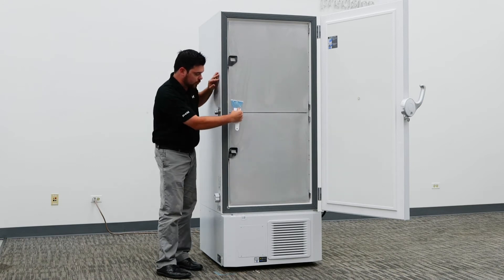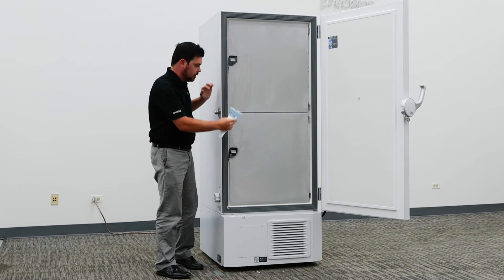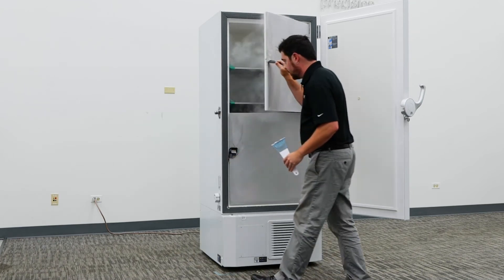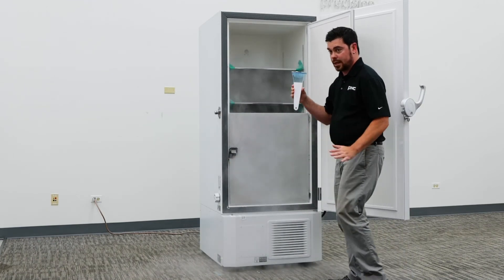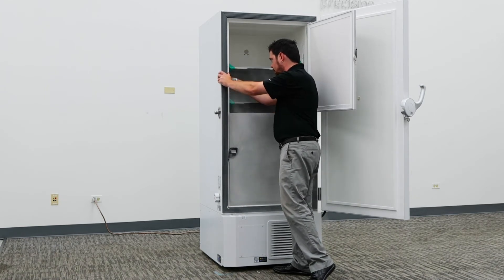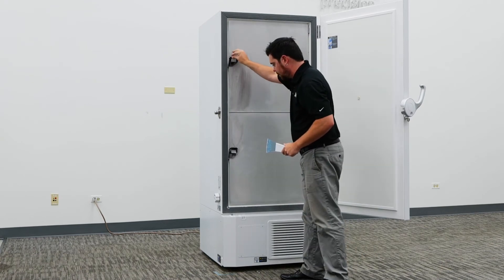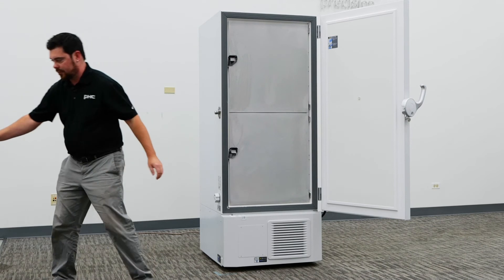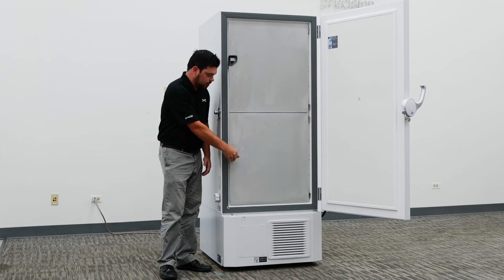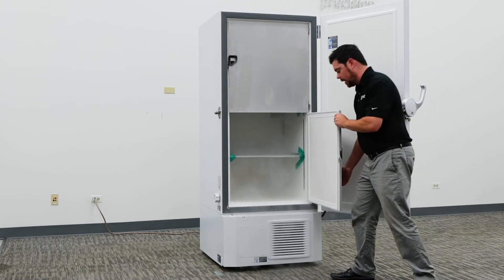This scraping can also be done on the interior portion of the chamber, using the same method with the provided ice scraper, removing any excessive ice buildup inside of the chamber. If ice buildup is severe, another simple method is to open the door and open your inner door to a 90-degree angle and lift straight up.